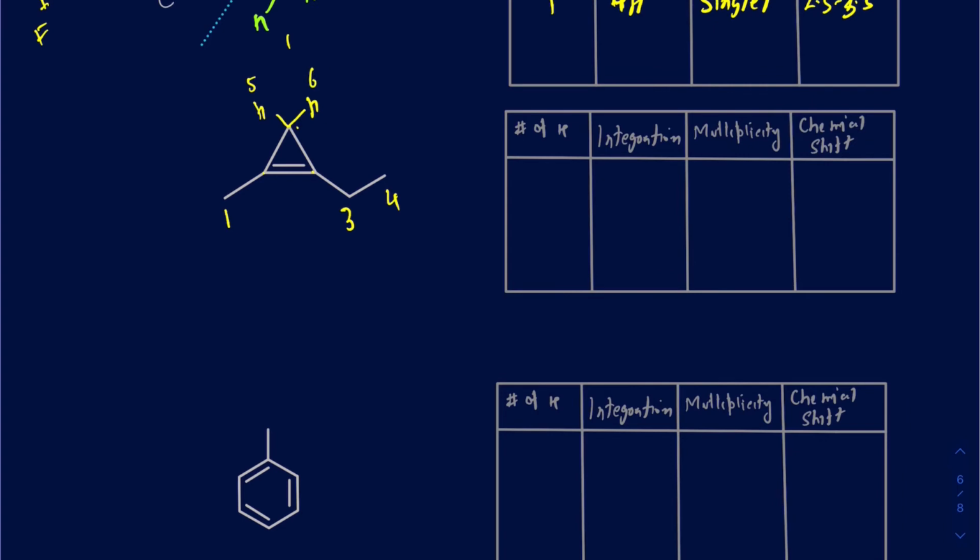So another way of saying they are going to be your diastereotopic protons. Now, typically, you'll say the diastereotopic protons will show up if you have another chiral center present already in the molecule, but it's not only limited to the chiral center, but it could be diastereotopic if it's a very small ring, such as this 3-membered ring, and there is going to be a double bond. Well, you don't necessarily have to have a double bond. Sometimes these cyclopropyl groups do show up as different protons because they are considered to be diastereotopic protons.